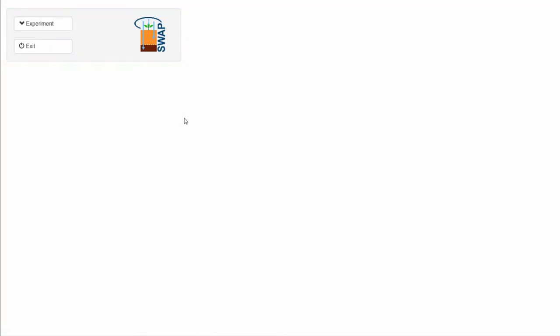I would like to start a new experiment based on the predefined experiment, Experiment 1. I need to select Experiment, which will open the drop-down menu.